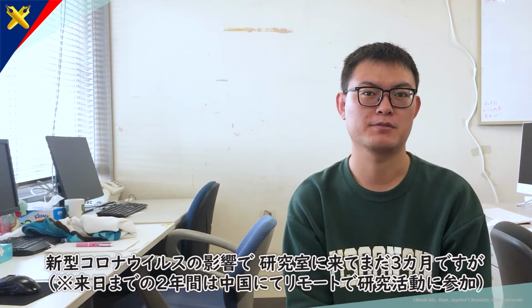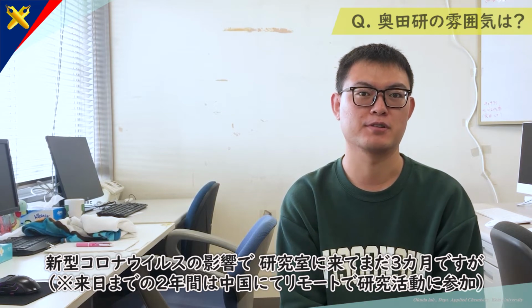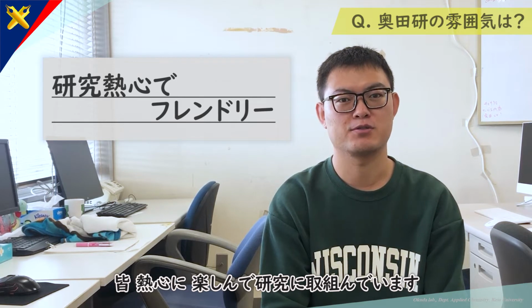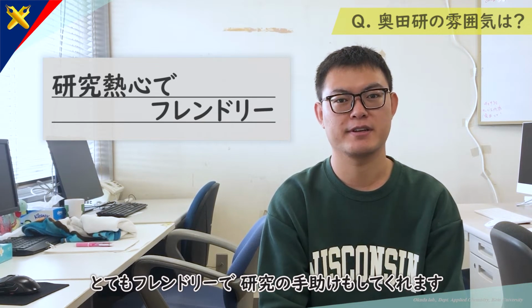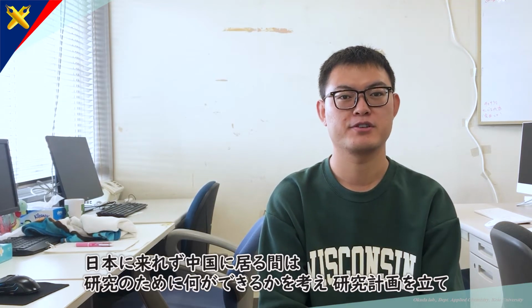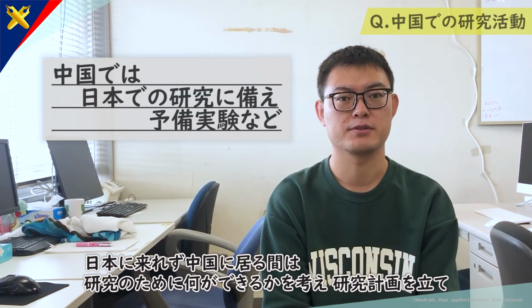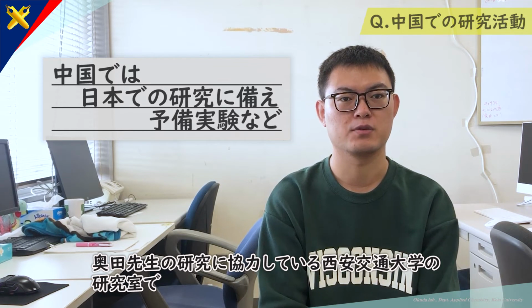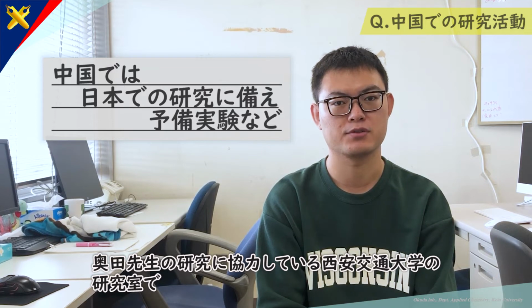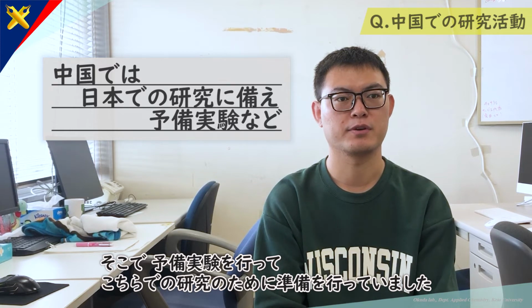Because of the influence of COVID-19, I just came to the lab 3 months ago. But I love this lab. Everyone enjoys their research and does what they are interested in, and they are friendly and help me a lot with my research. When I was in China, what I could do was just start research and prepare my research plan. I also joined one professor's lab, who cooperates with Okuda Sensei, at Xi'an University. I did some pre-experiments in his lab to prepare for my research here.